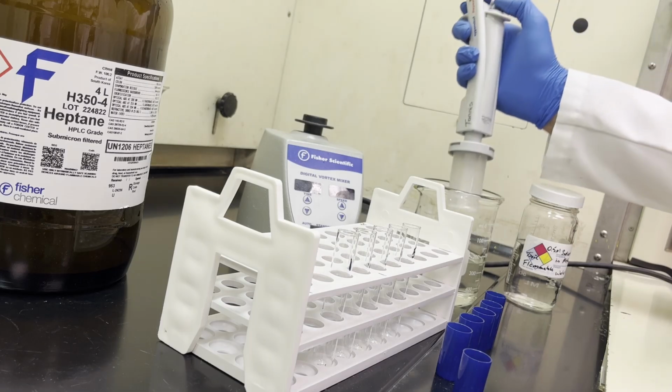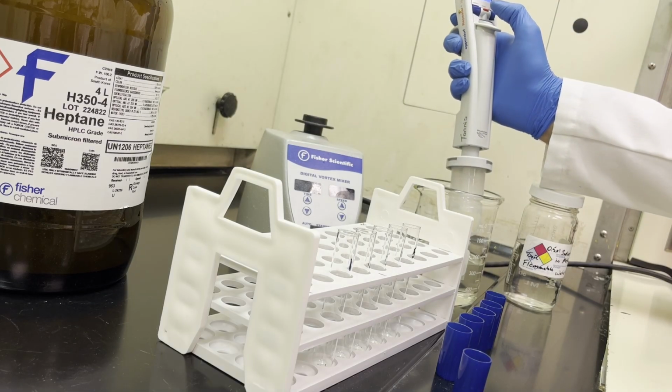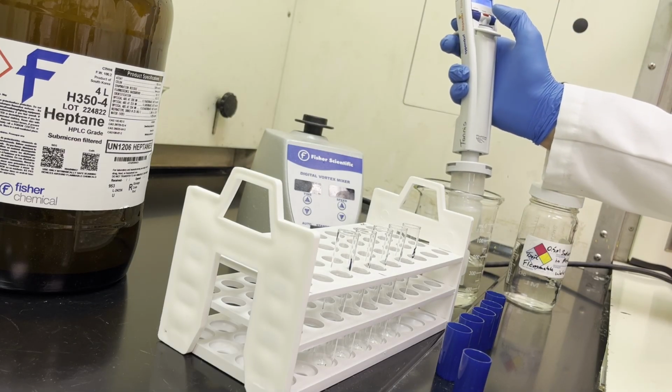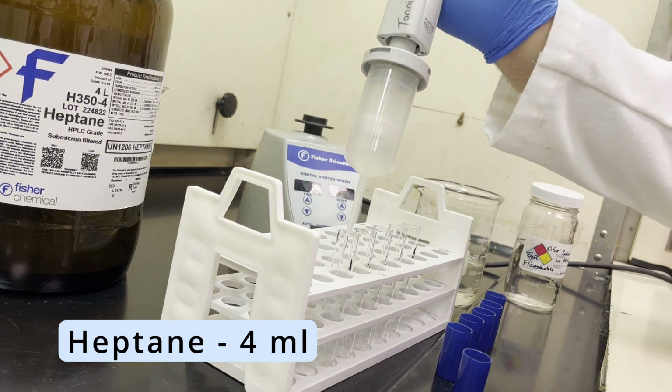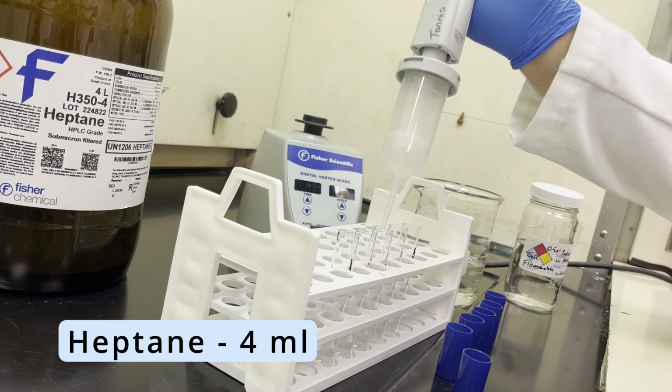Oil is extracted from the seed tissue using an organic solvent such as heptane. This step and subsequent prep steps are done in the fume hood to avoid exposure to the chemical vapors.